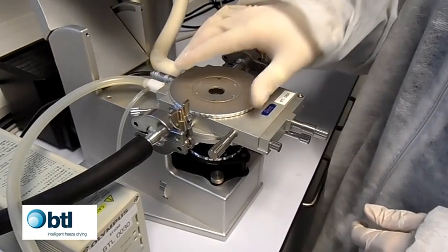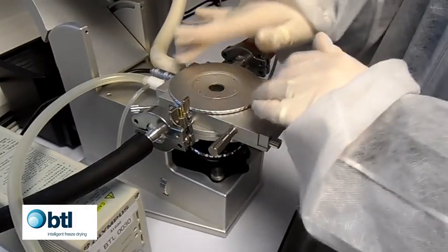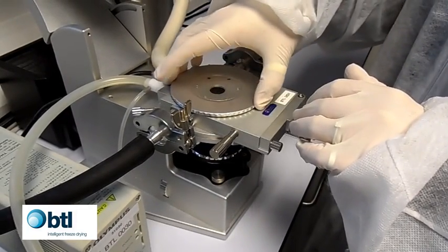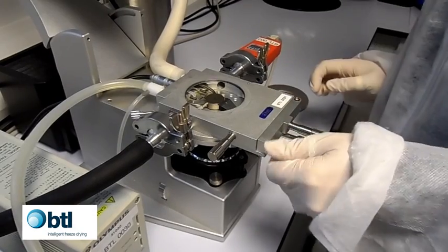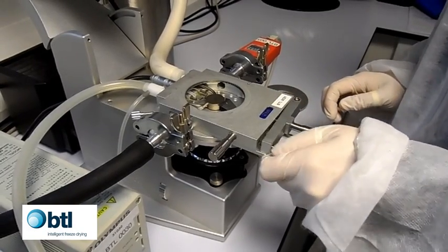Tilt the arm of the imaging station back to allow easy access to the Lio stage. Unscrew and remove the lid. Unscrew and open the door of the sample loader.